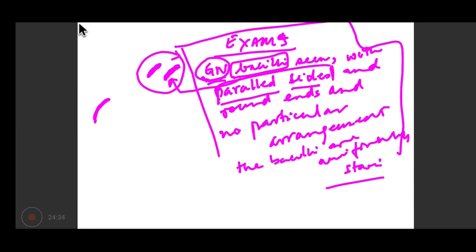Okay, acha, washing. Washing is after every step. I'm sorry, I can go through the steps again. I think I forgot to mention that. Okay, I'll mention it. And then I'll help you remember which staining procedures we don't wash in. Let me go back to that. Let me just complete.